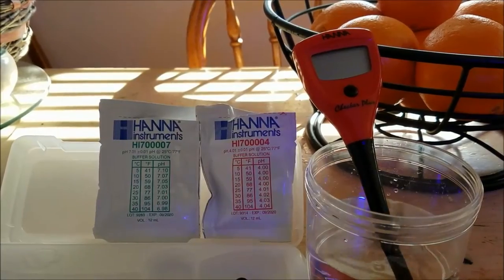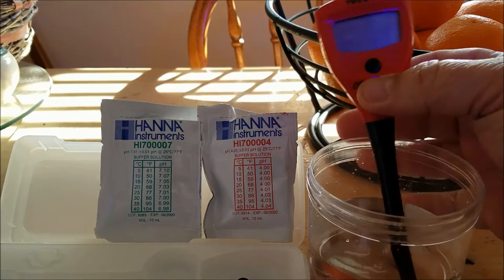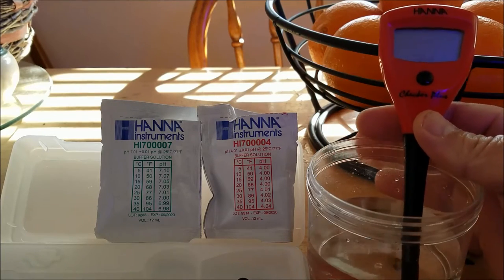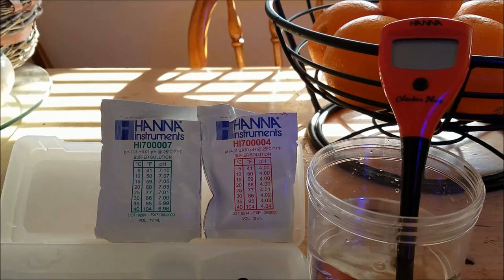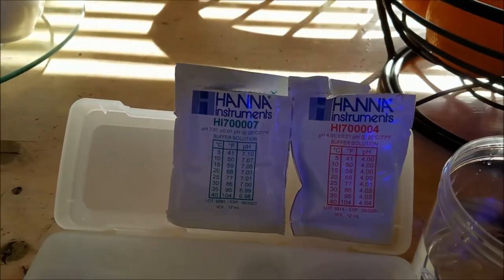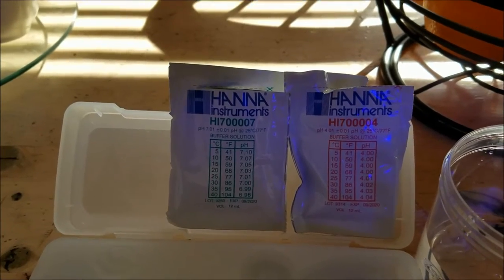All right, let's get on with the review. So here we are and what we're going to do now is calibrate the Hanna Checker pH Checker. Right now the checker itself is sitting in some RODI water, and next to it you can see I have the pH 7 and pH 4 solution.